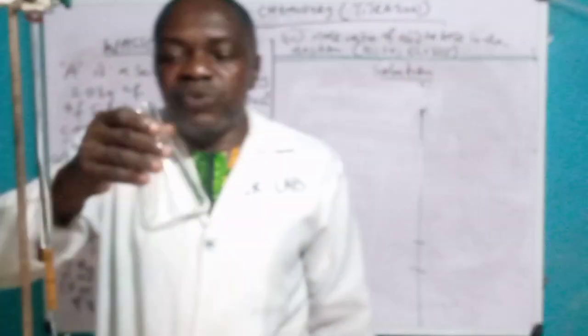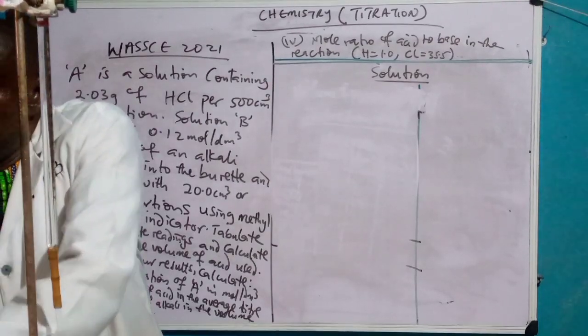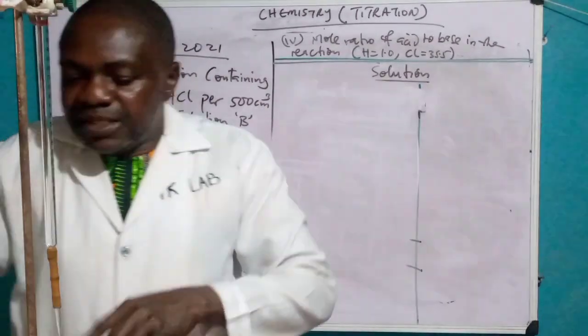Then you rinse this one with water, which makes it neutral. We have already washed and we have already rinsed. But remember, don't indicate wash. It's only rinse that WAEC accepts. So let's add the solution.